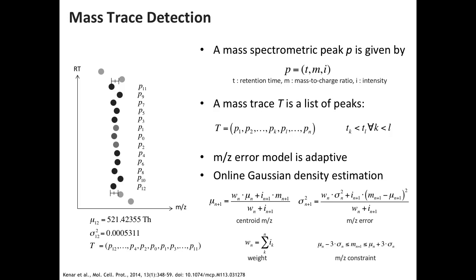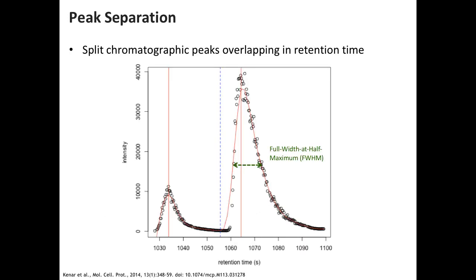If you have mass traces that run over the whole length, it's going to pick those up as well. So there are a couple of issues that are still problematic, but on the whole, this is probably the most robust way I've seen to pick mass traces. Once we have these mass traces, we apply similar techniques as XCMS to detect peaks on them.